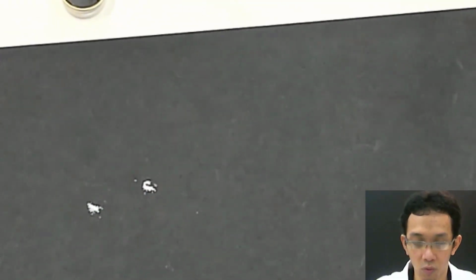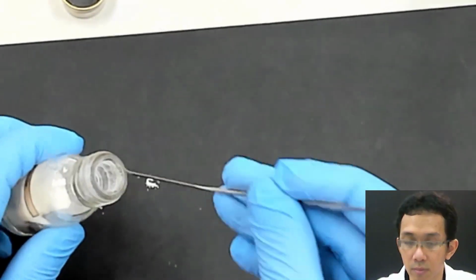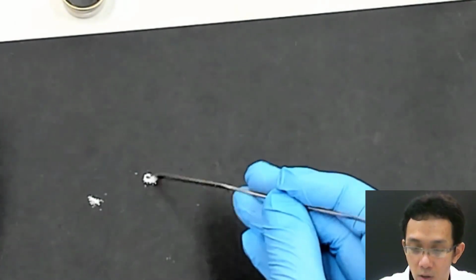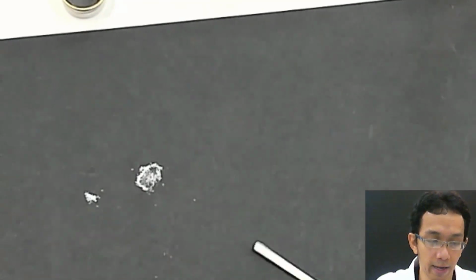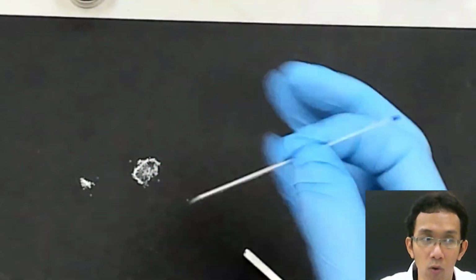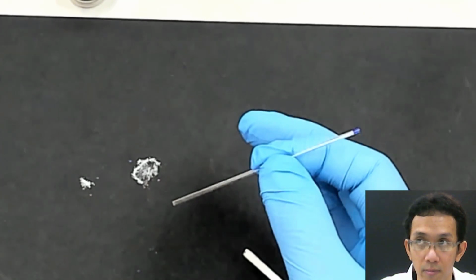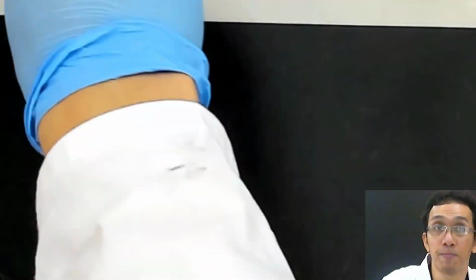So in order to do it correctly, you need to take your, what we call, known sample, mix it with your unknown sample together on top of that, and then mix thoroughly like that. And then you put it on this thing, and then you do whatever we did before. So that's basically how to mix your unknown and known mixture. Okay, so that's done for this part.